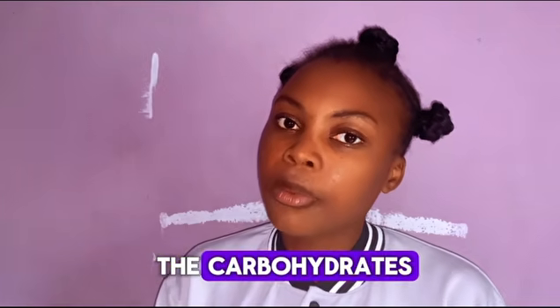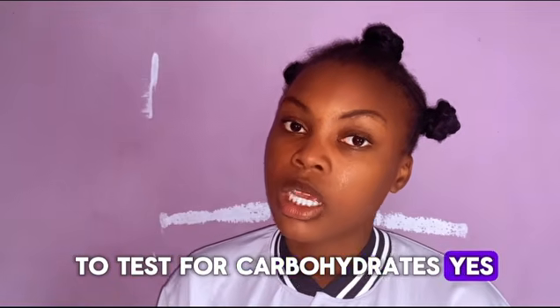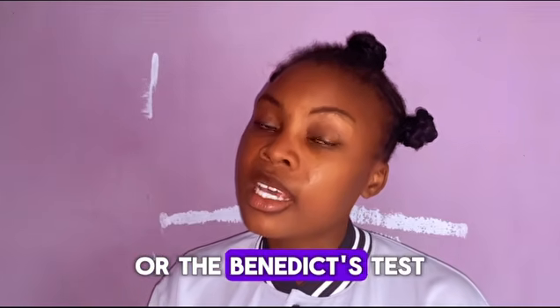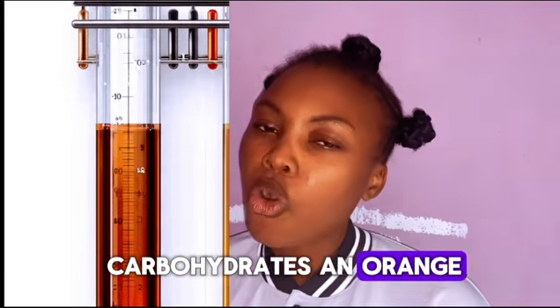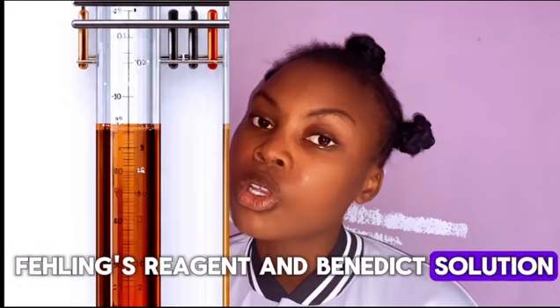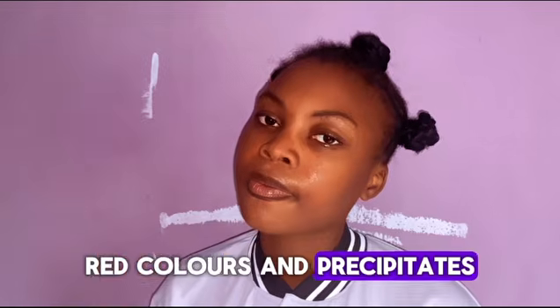Now let's look at the carbohydrates. What you can use to test for carbohydrates. You can use the Fehling's test to test for carbohydrates, or the Benedict's test, and they both give carbohydrates an orange-red color precipitate with Fehling's reagent and Benedict's solution. So they both give an orange-red color precipitate.